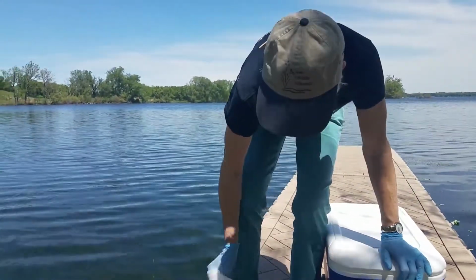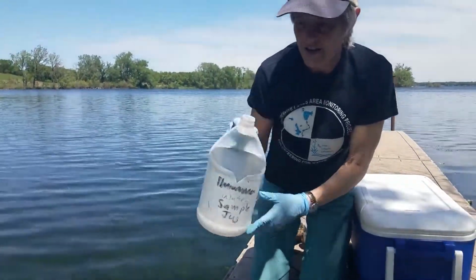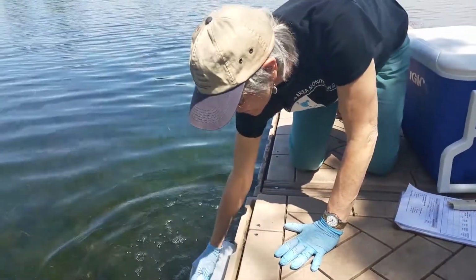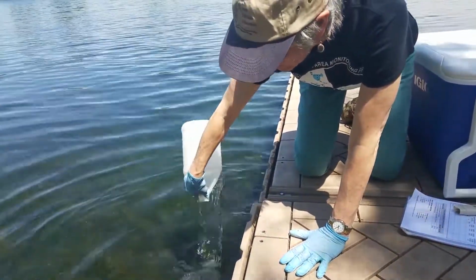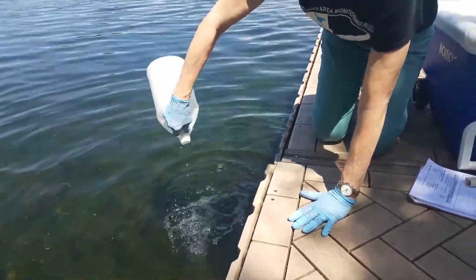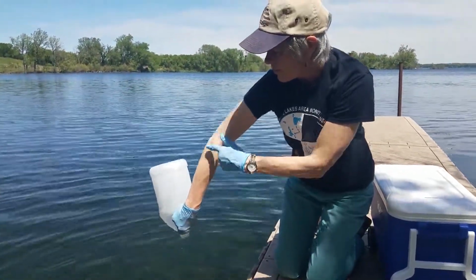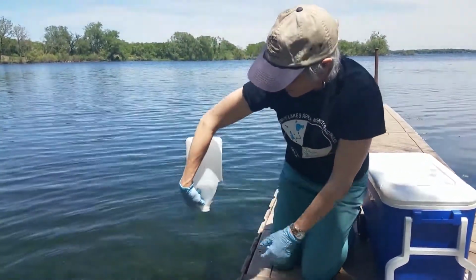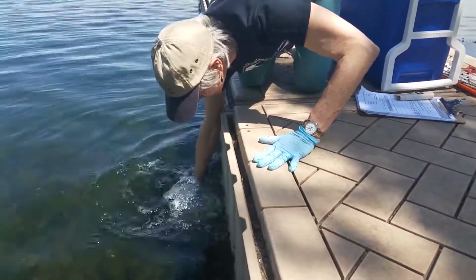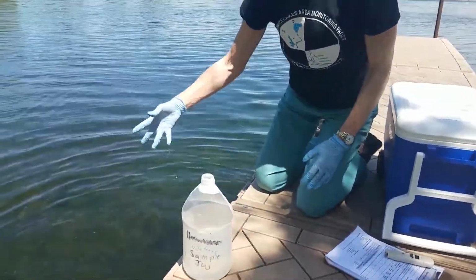First thing you need to do, got your water sample jug, rinse it 3 times, leaning outside the boat. And then, to collect your sample, you want to submerge it completely under the water to like your elbow with the open part down. So I'm under the surface of the water, and now I have my water sample. Now my hand's wet.